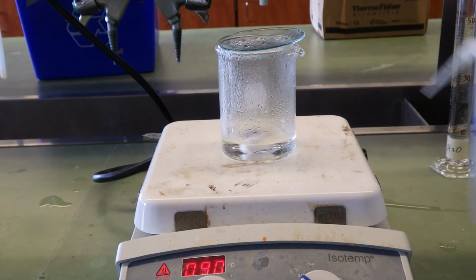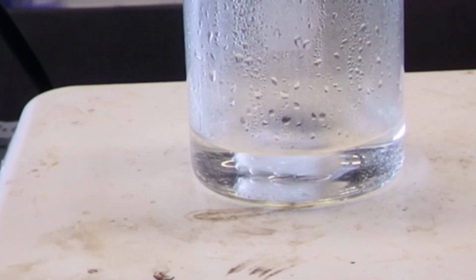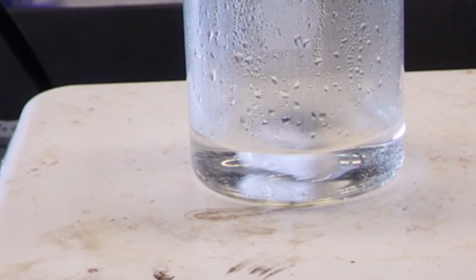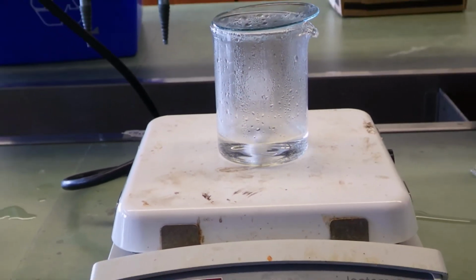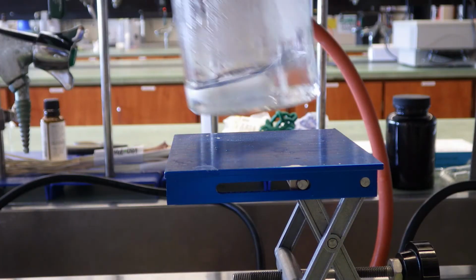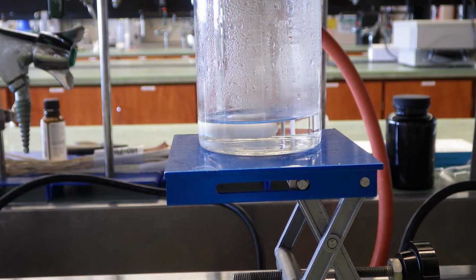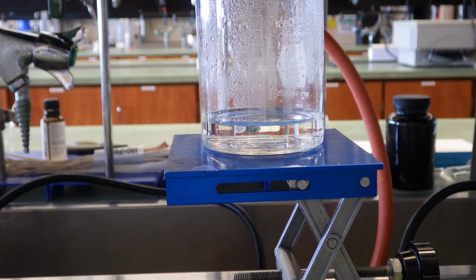And once those final crystals go into solution, we know that we have a saturated solution, hot, and when it cools slowly, we should be able to grow some pure crystals of our ASA product. Alright, I'm going to remember to fetch the mag stir bar out before crystallization occurs this time. And I'll cover that with a watch glass to prevent evaporation and leave it sit undisturbed while it cools to room temperature.